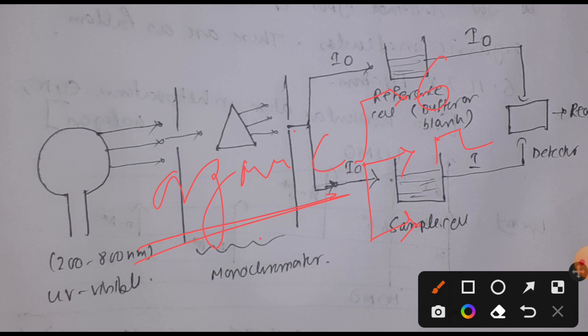That means wherever you find any double bond or triple bond, you can be sure a pi electron is present. The other one is n, the non-bonding electron. The n can be found in the case of heteroatoms. Heteroatom means, along with C and H, if you find any O, N or halogen containing molecules, then you can say there will be the presence of n electrons.